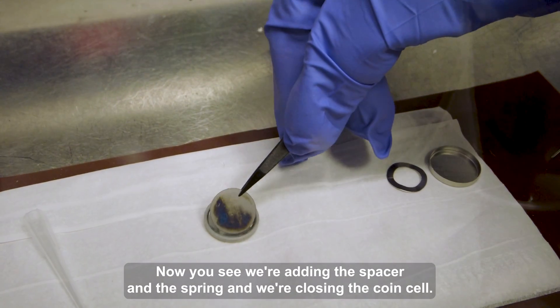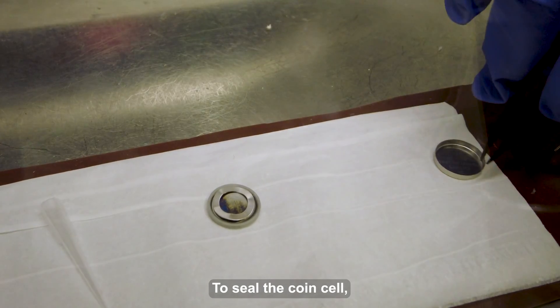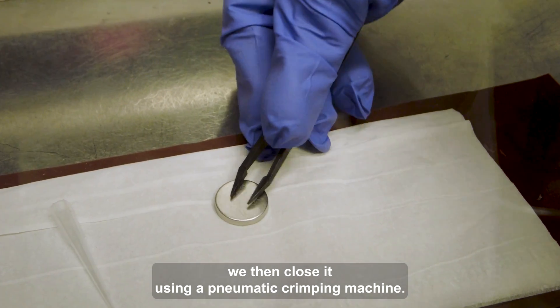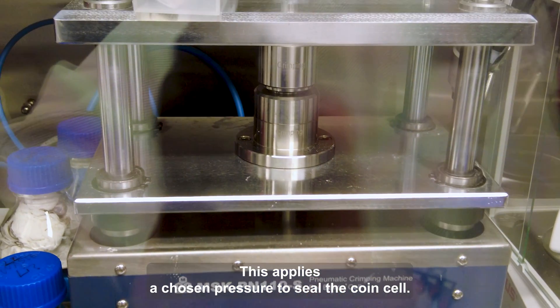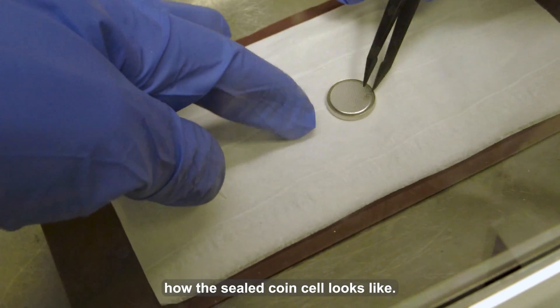Now you see we're adding the spacer and the spring, and we're closing the coin cell. To seal the coin cell, we then close it using a pneumatic crimping machine. This applies the chosen pressure to seal the coin cell. And now you can see how the sealed coin cell looks like.